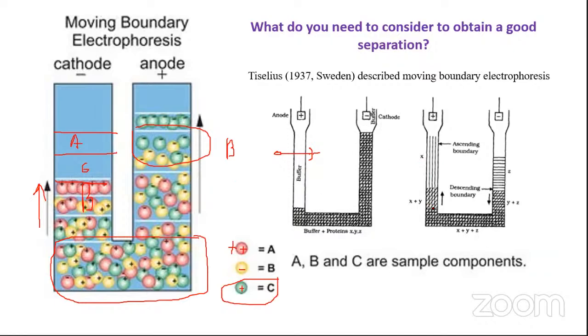Okay, and that is what is shown over here in this figure. You can see that there is never complete separation happening. You might get some zones of some molecules, but there will always be a mixture remaining. There will be no complete separation.